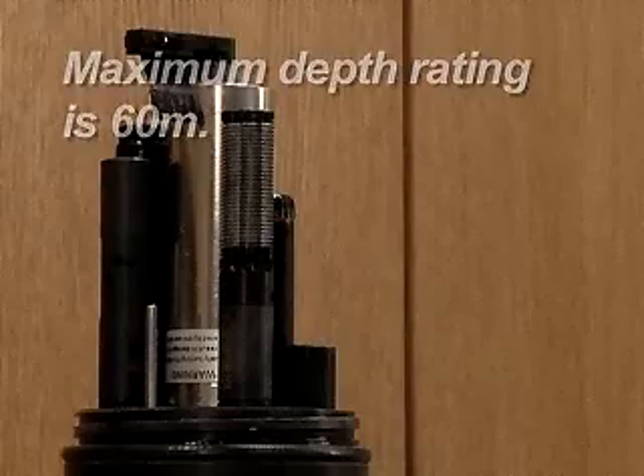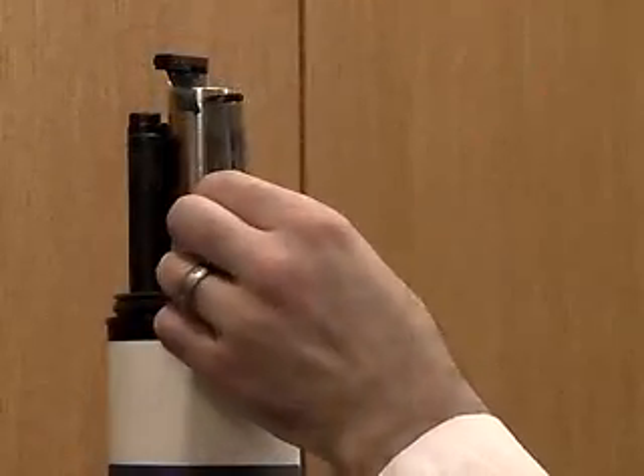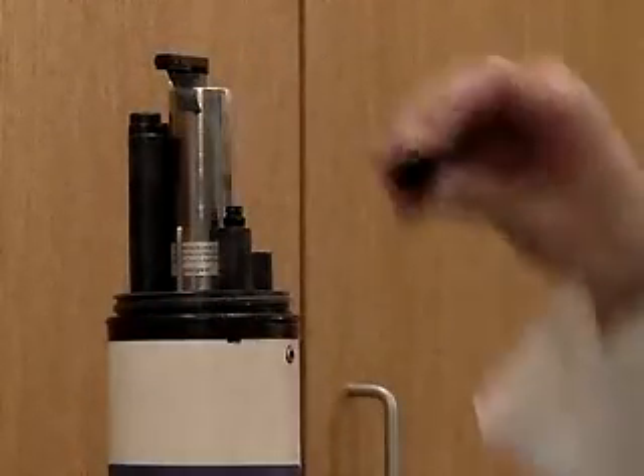If the sonde will be sent below 60 meters, remove the membrane cartridge and install the protective cap on the sensor base.